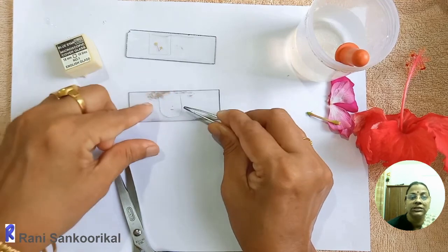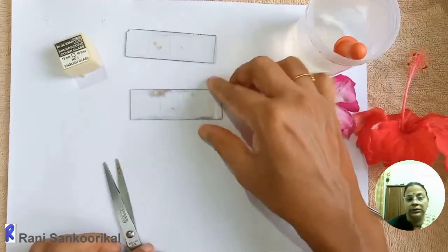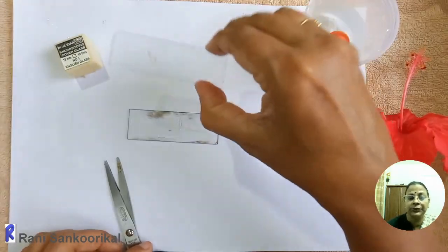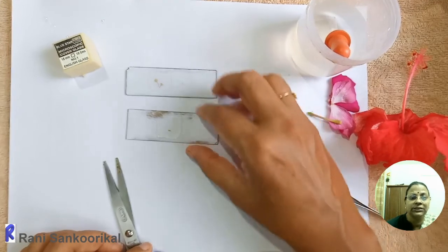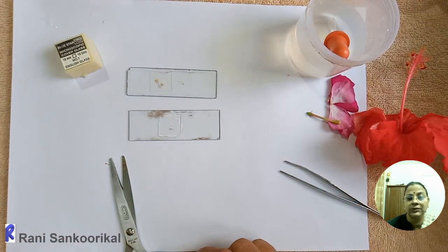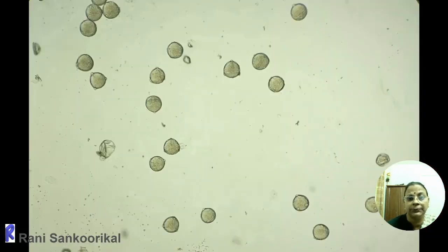But hibiscus, it is easily visible, very easily we can handle it. So whatever it is, either vinca or hibiscus, you can do it and press it gently, and after 30 minutes you can take this one and keep it under the microscope. Like this you can keep it.